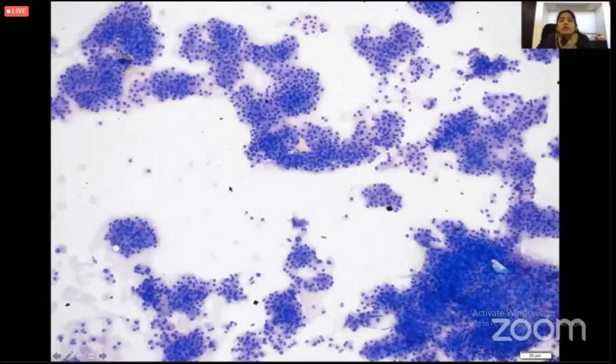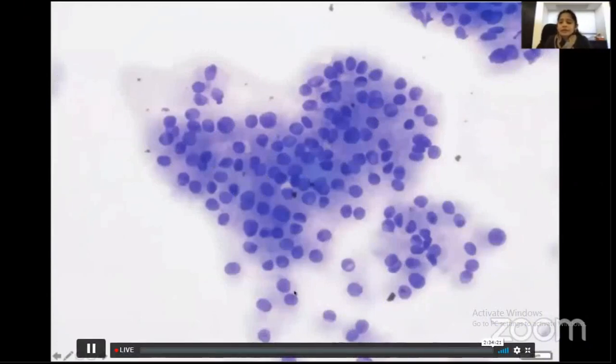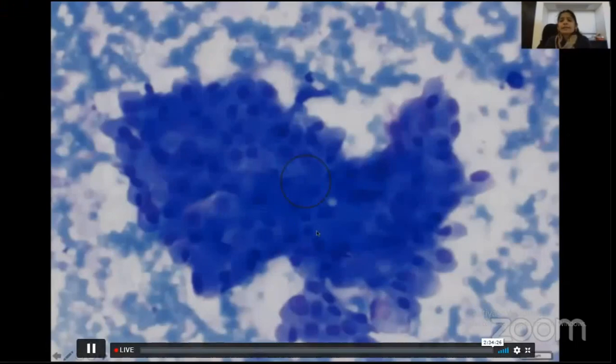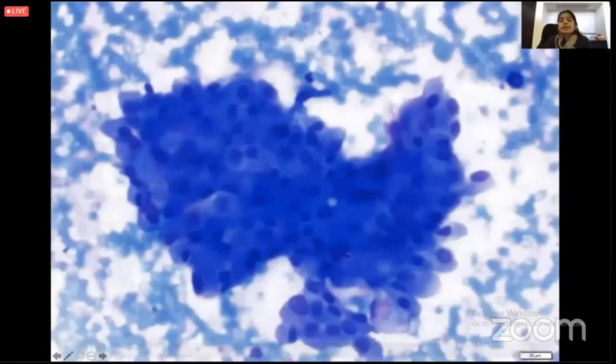That's how they put in a needle to know what exact category it would fall into, or which type of neoplasm. Again, a lot of pictures. As you can see, we are cytomorphologists and we would like to see more pictures. So Hurthle cell, we tend to put it in a separate category.